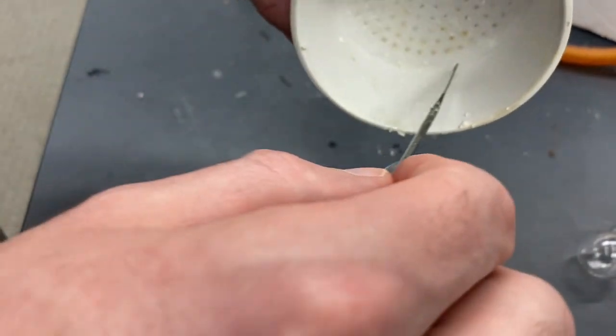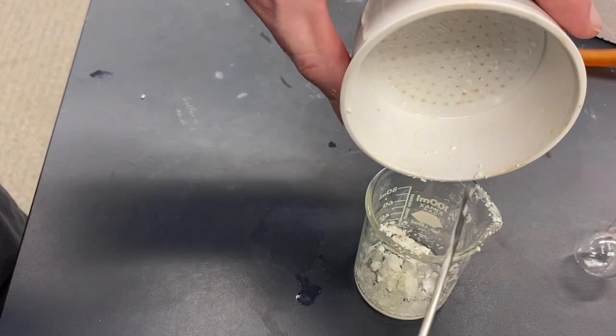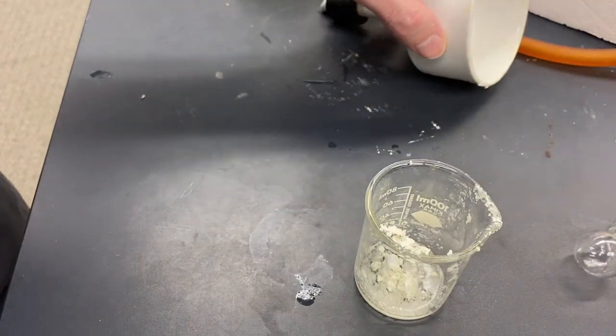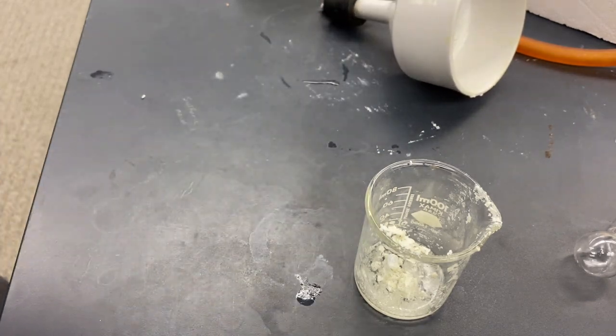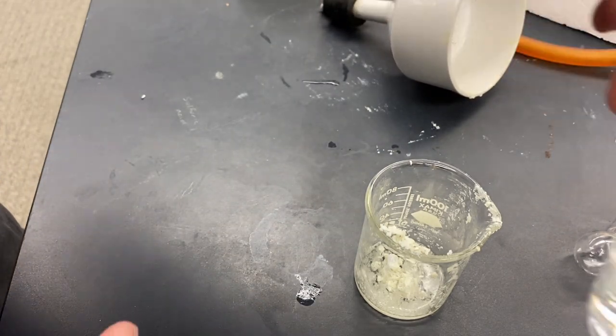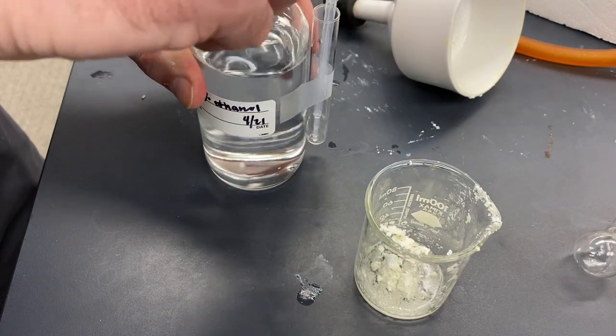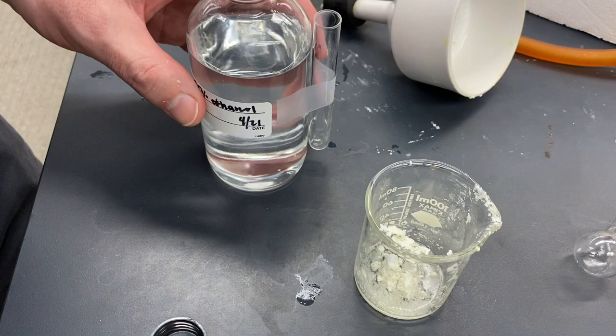That's pretty good. Right now the ethanol is cold. So we're not going to add enough to get all of this to dissolve right away.